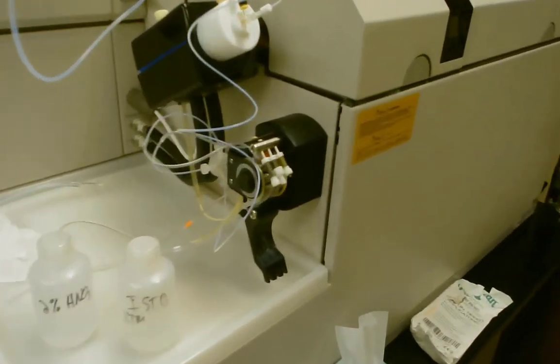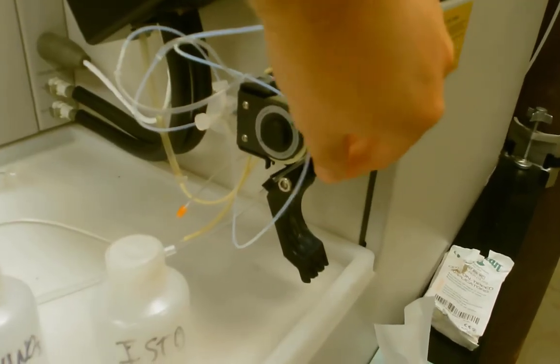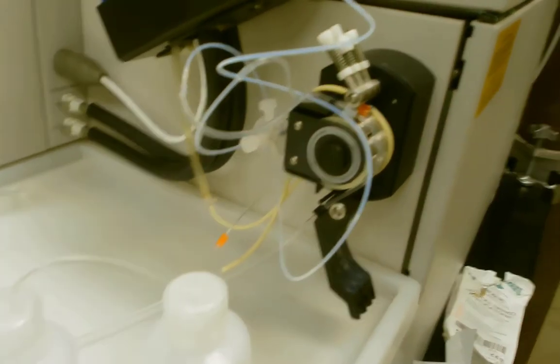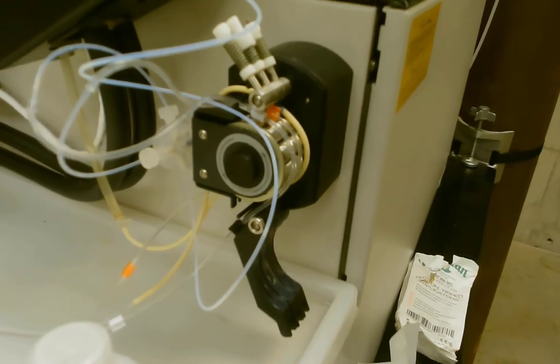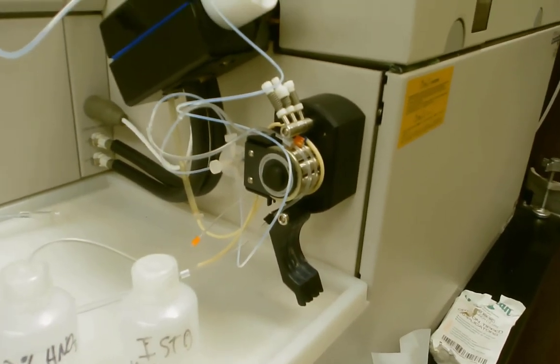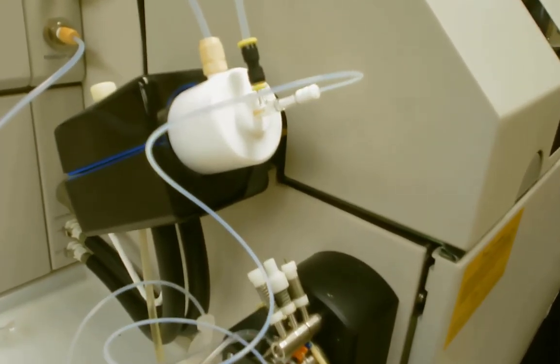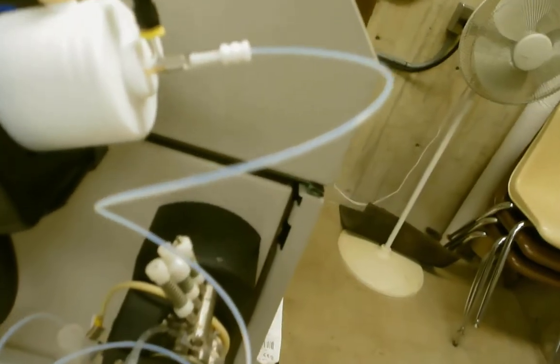The pump that pumps the liquid is over here. It's not currently set up, but this is a peristaltic pump, and it pumps the sample from the probe all the way into the spray chamber. So it pumps the liquid into the nebulizer here.